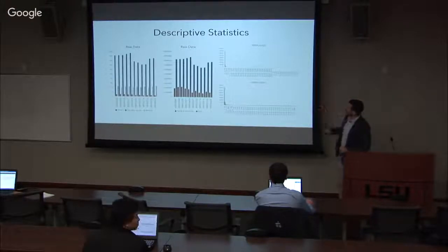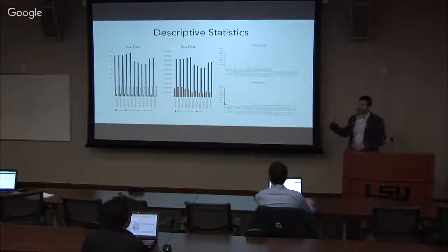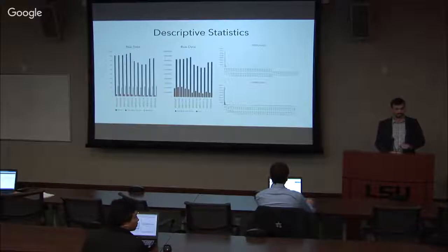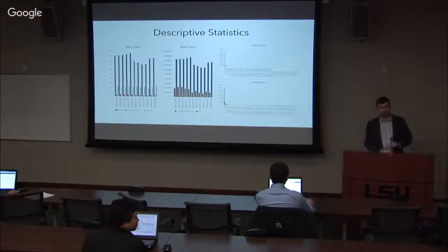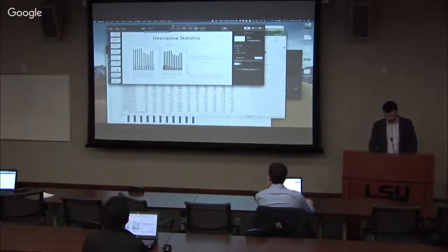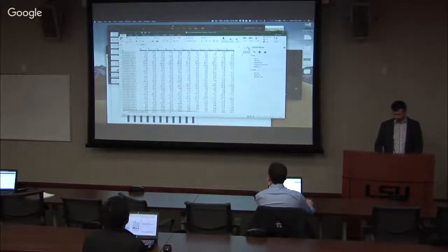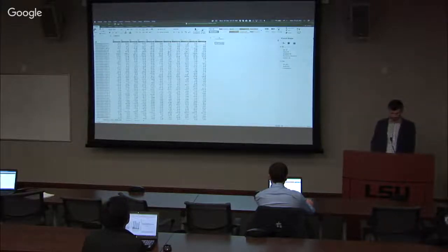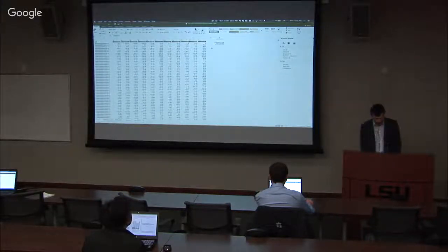Here on this side, you can see for those two samples that we consider as, yeah, go ahead. Just to go back a little bit, I was a little confused about what exactly we're taking the log fold change of. Like in the slide, you have just one column where the operation is done. So is that just an example? We're taking the log of the raw data. Not the fold change, maybe, yes, yeah, so I'll delete this.